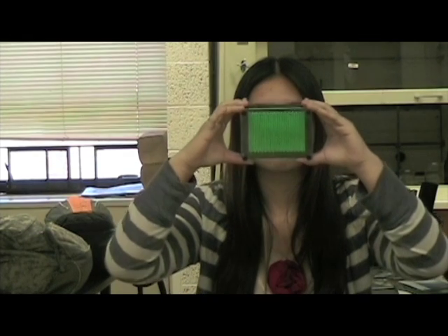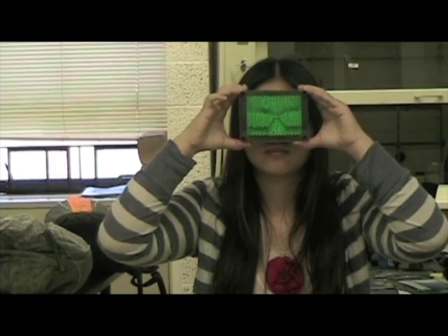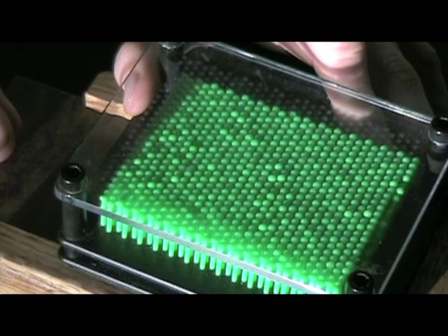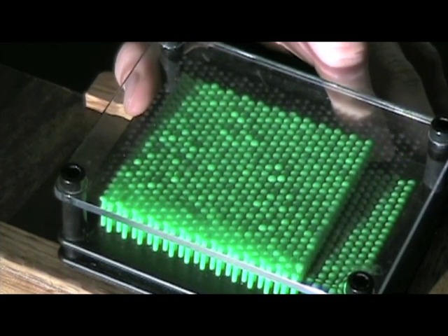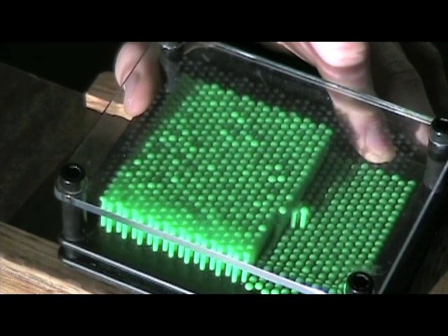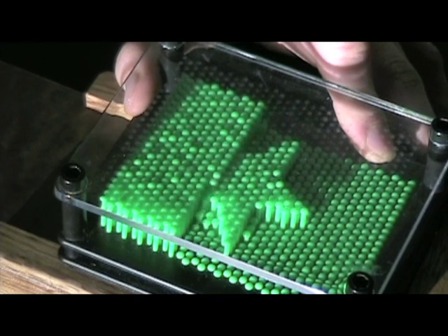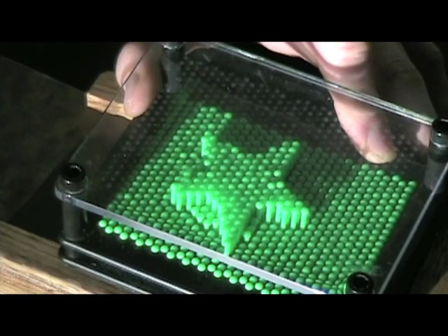We can use pin picture toys to create a 3D image of an object, such as Chili's face. A mechanical scanner can create images of unknown samples. The probes examine objects row by row, and the scanning rate is determined by how fast you pull the scanner transport. The resolution is very crude in this device compared to the AFM, which can range from 256 lines to 4,096 lines of resolution.